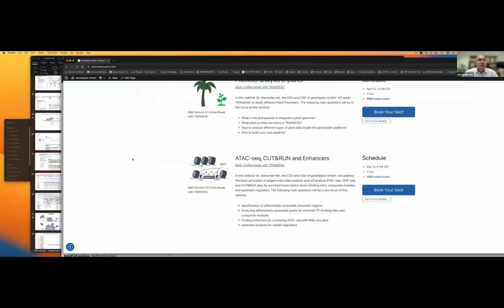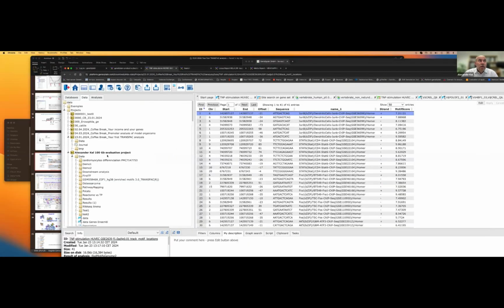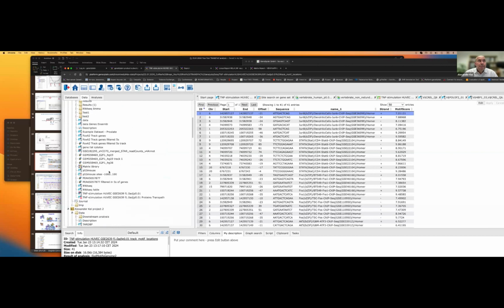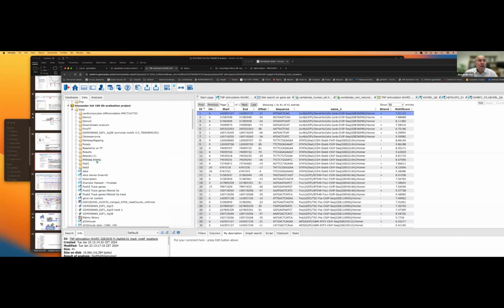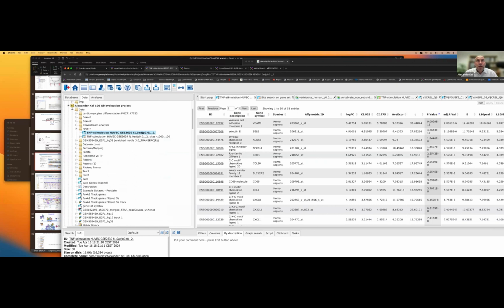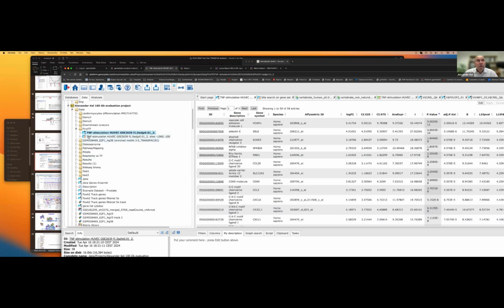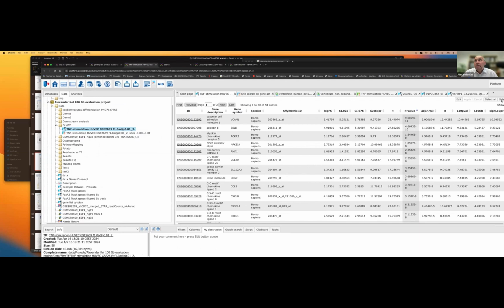Today I showed you how to do analysis just using these tools. We generate various types of outputs, like tables, and first you should know that anything you get here is exportable. You can export it as a tab-separated table, or you can export results as a match report.